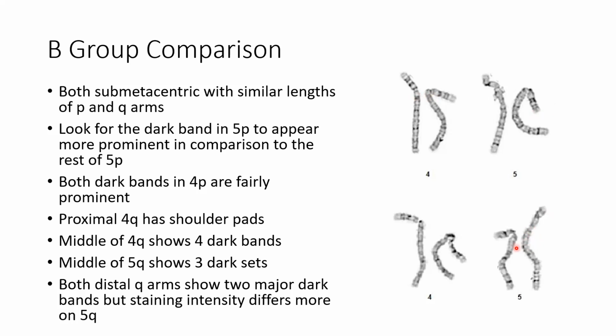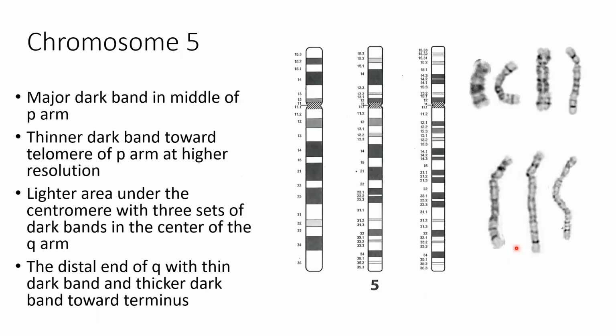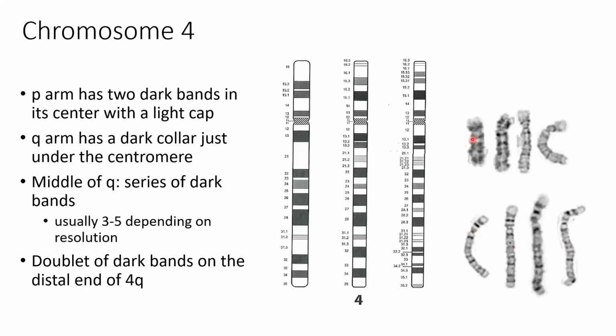Oh, I thought it was very close, but it's not that close to the centromere. Well, on the higher resolution, no, you're right. That's a good pickup there. So on these shorter chromosomes, yeah, it is pretty close to the centromere, but there is something in there.